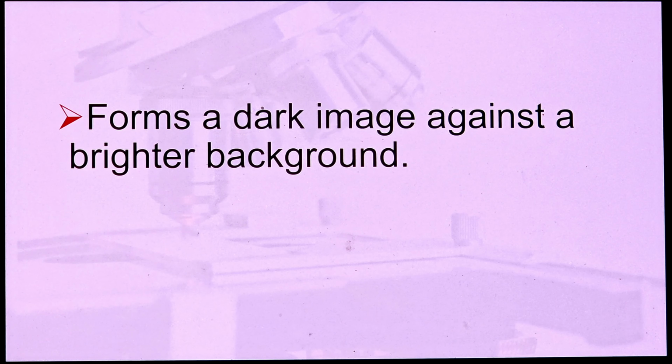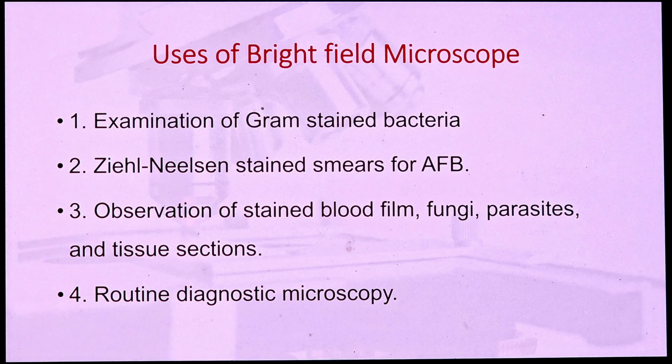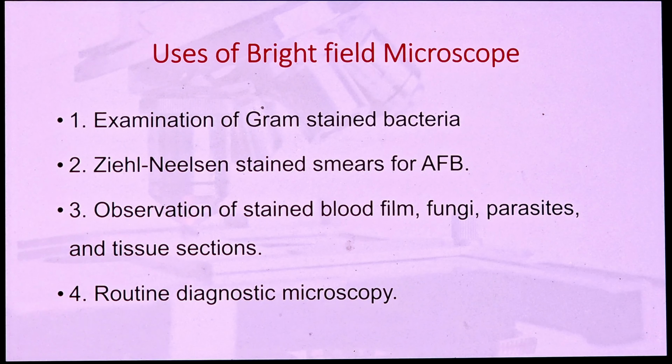So the bright field microscope forms a dark image against a brighter background. Uses include examination of gram-stained bacteria, Ziehl-Neelsen stain smears for acid-fast bacteria, observation of stained blood film, fungi, parasites and tissue sections. It is mainly used as the routine diagnostic microscopic procedure.